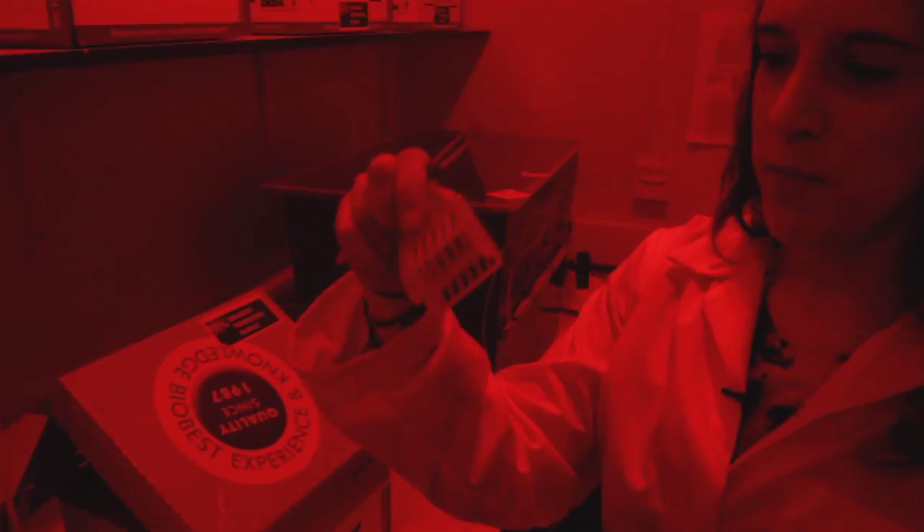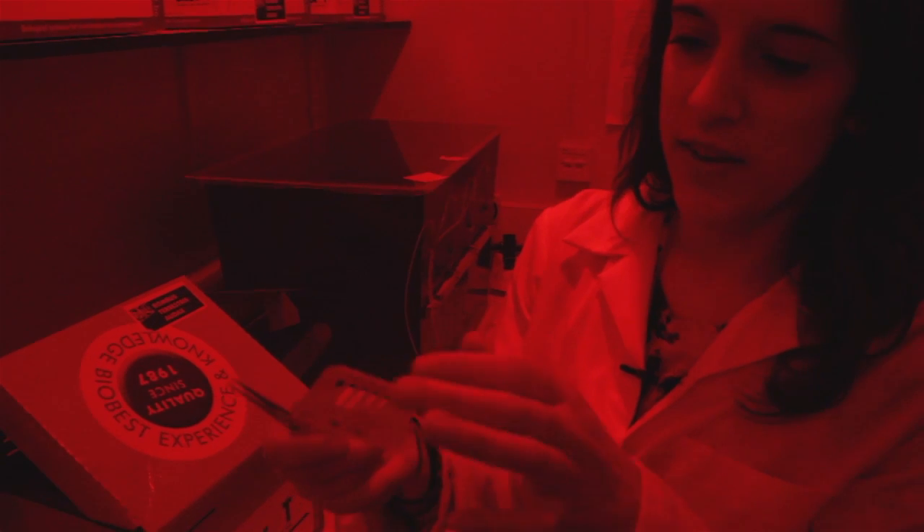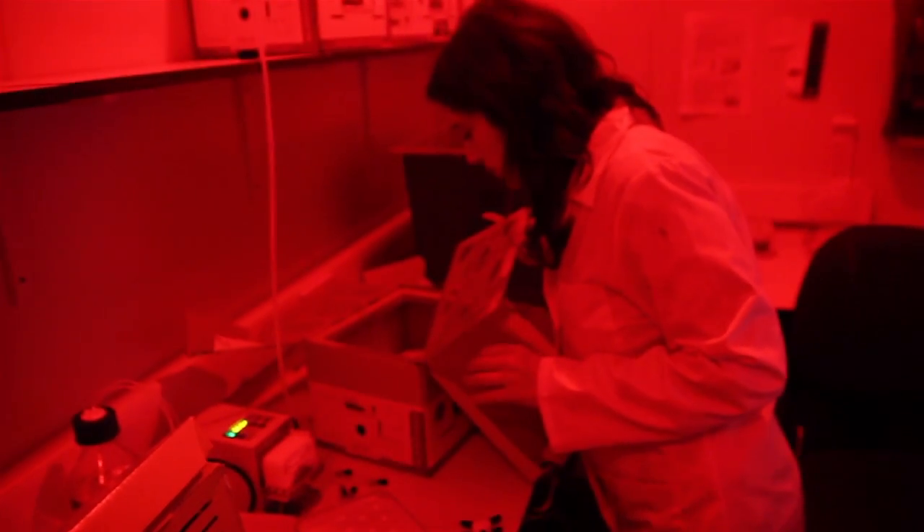This is a little bee scoop. They crawl inside and then I close it. Then what we're going to do is put them into the fridge for about three minutes, and that's just like a cold day for them. We're literally just slowing them down like they would be in the wild.